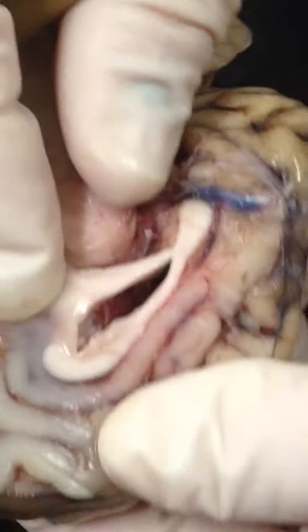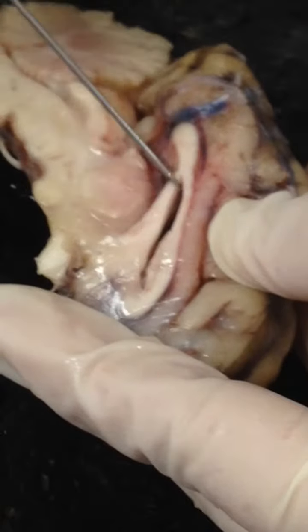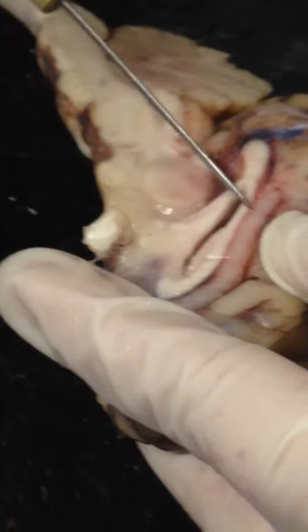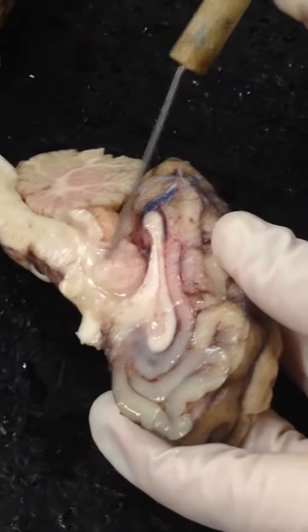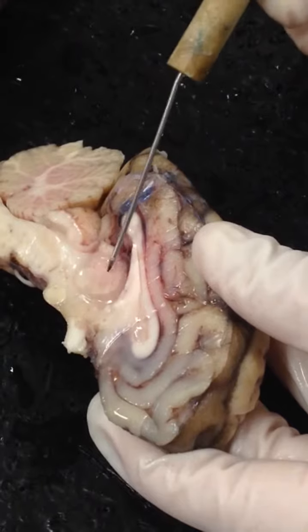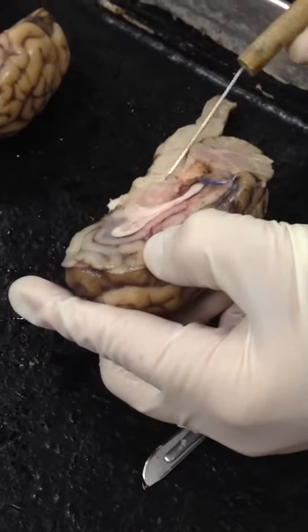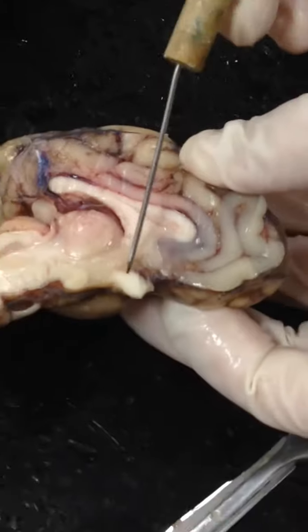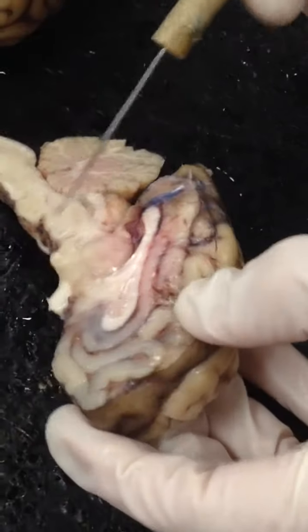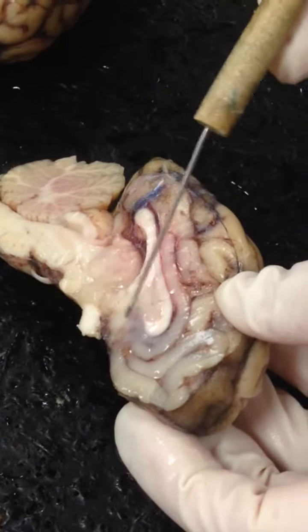Okay? Alright. So on the top part, you have your corpus callosum. Okay? The top white line there, corpus callosum. The bottom is your fornix. Okay? This circular structure you see here, the thalamus. See here, thalamus. Alright. This is part of that optic chiasm, alright, that we cut in half. Between your thalamus and your optic chiasm, right, you have your hypothalamus, this region in here.